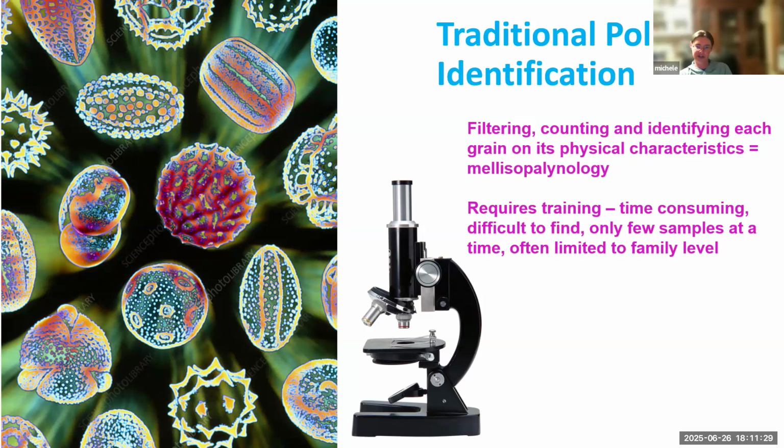And traditionally how pollen was identified in honey or in a collected pollen sample was that you took that honey, you concentrated it, you filtered it out, you graded it out over a screen, and then you very painstakingly looked under a microscope and would identify each pollen grain and then count all of those grains that you're looking at. It sounds way more complicated than what I'm doing.